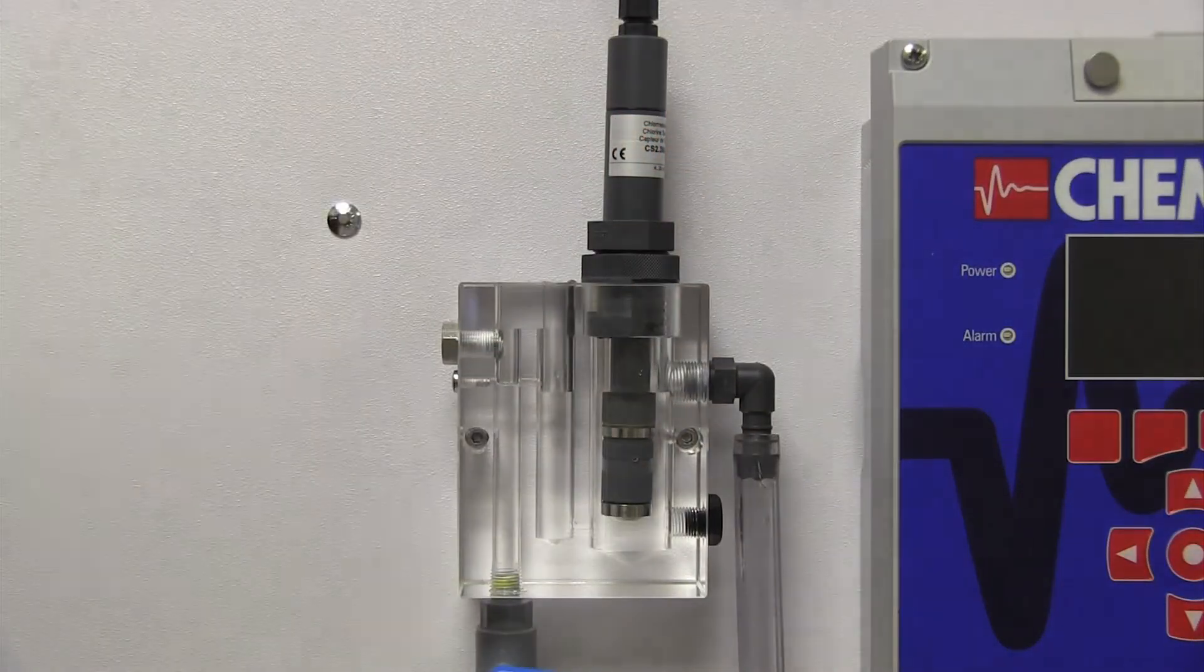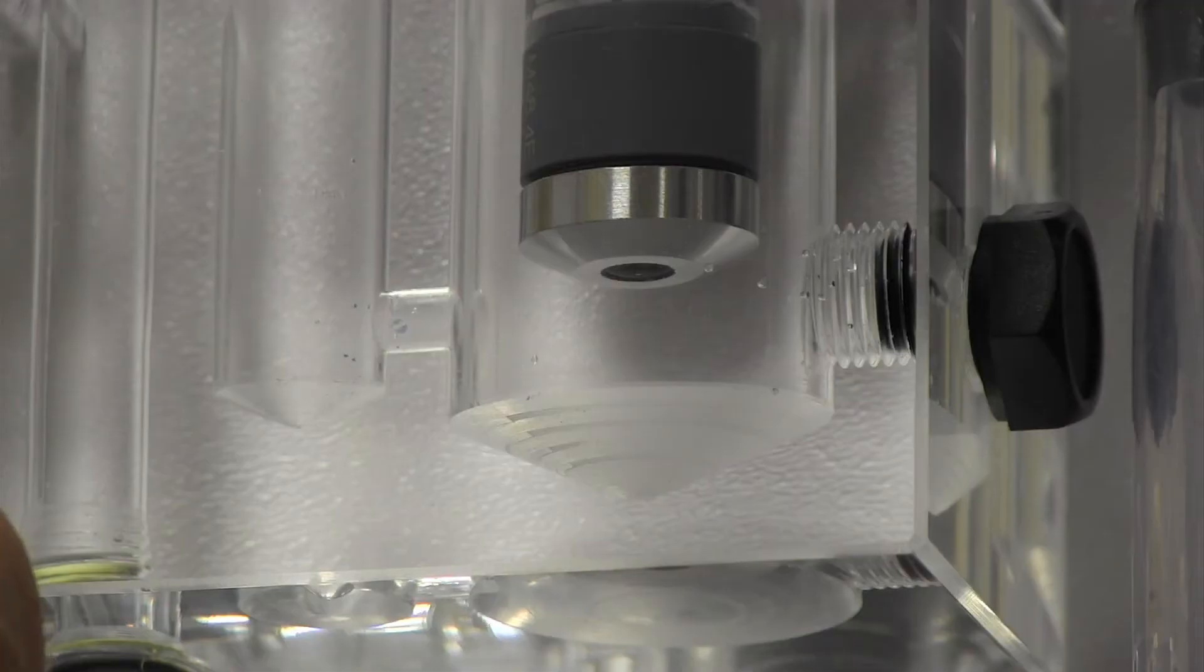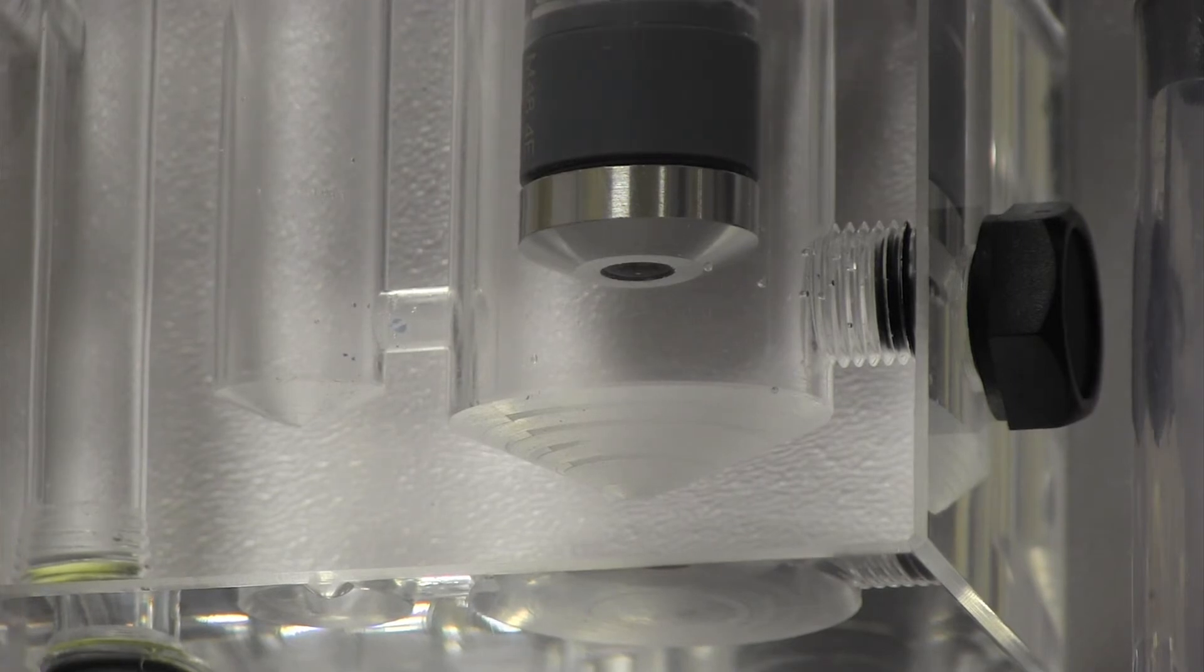Water exiting this tube needs to pass across the tip of the probe to prevent bubbles from forming on the membrane, which could subsequently impact the accuracy of the chlorine reading.